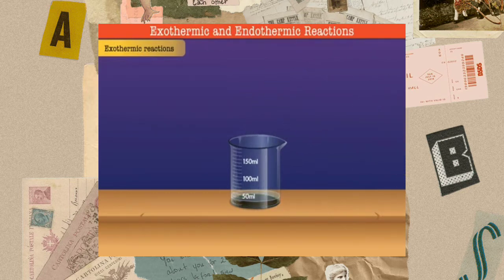Stand back and observe. The sugar starts changing color and finally turns black and rises in a column, releasing steam and a pungent smelling gas. The black mass left behind is sugar charcoal, a form of pure carbon. This dehydration process is a highly exothermic reaction, turning the water content to steam.